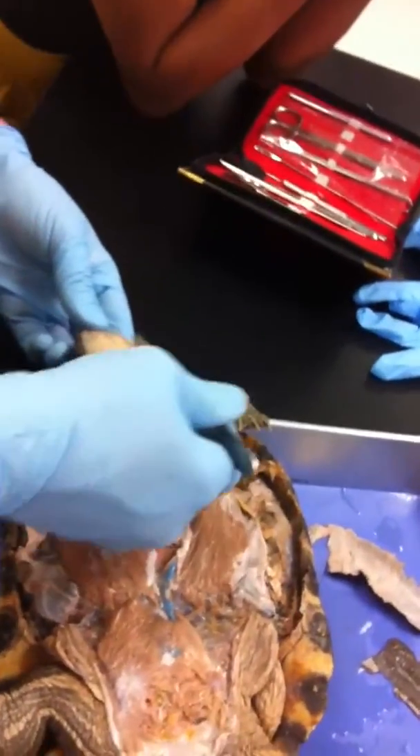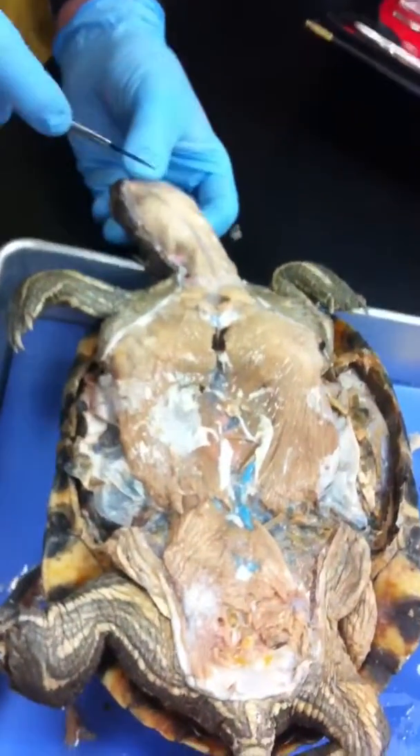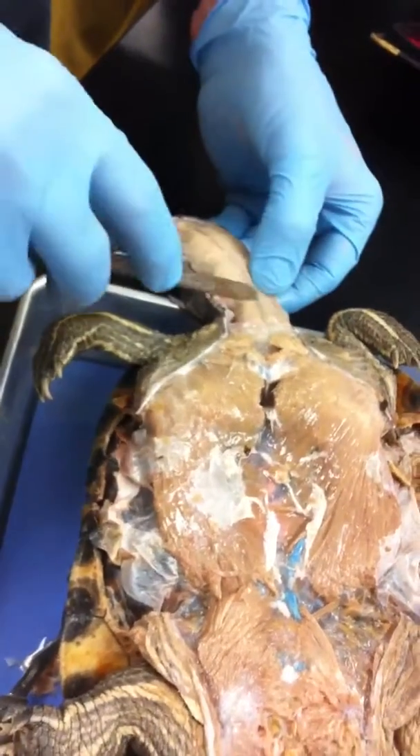There's a collar muscle that goes this way — that's the latissimus colli. What I'm going to do is carefully separate this, because the trachea is right here.